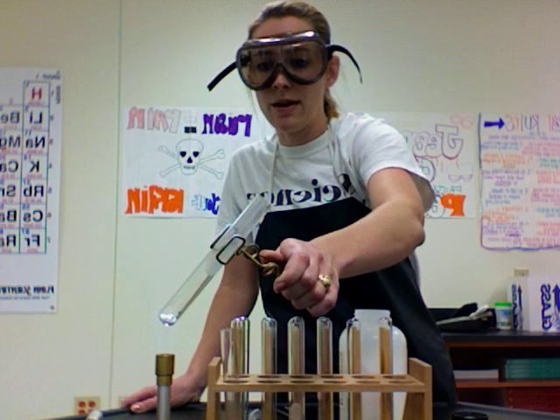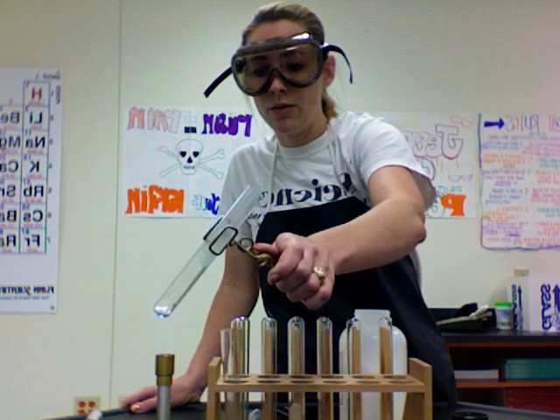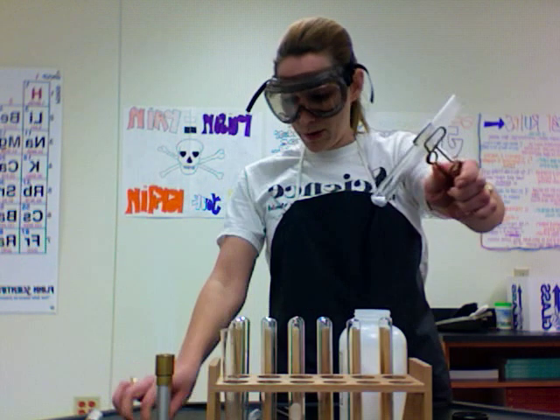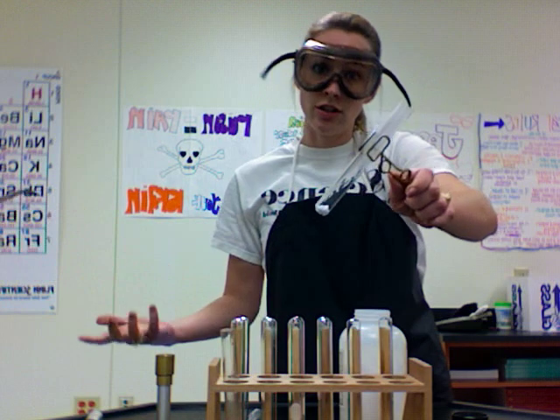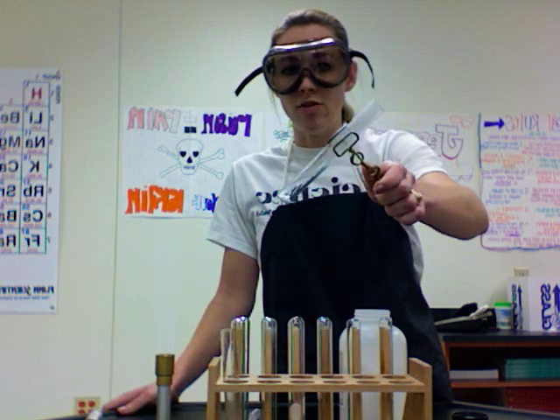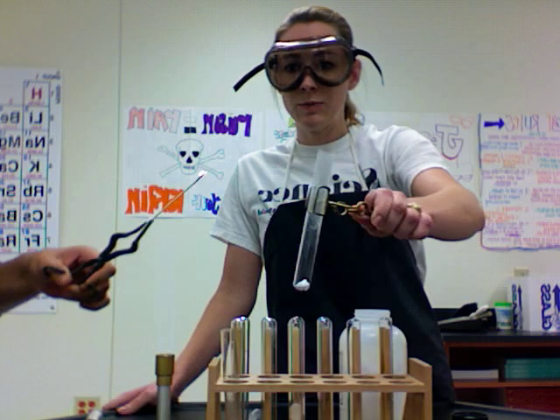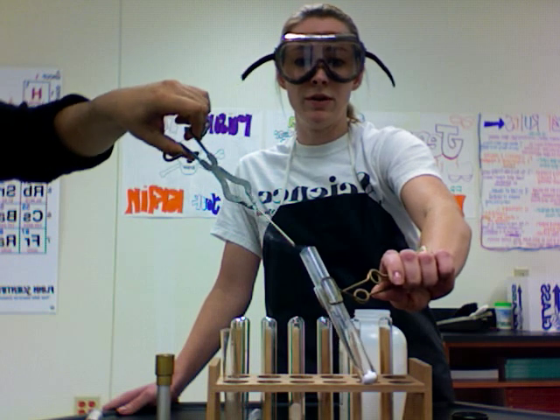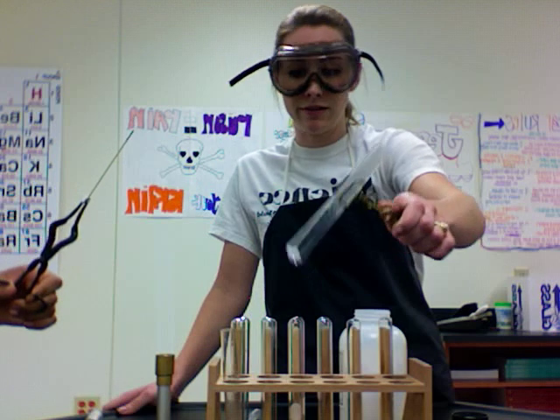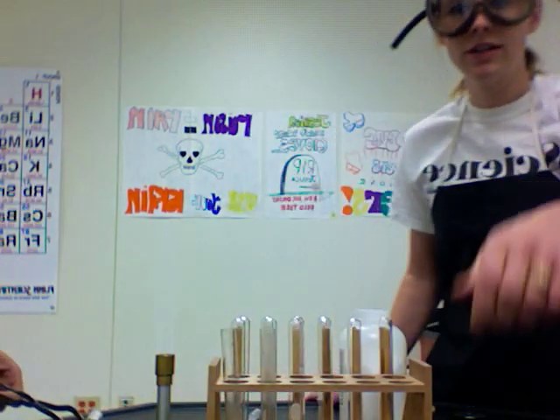I'm just going to let this heat for a little while and let it decompose, and then we will test for the presence of carbon dioxide. Carbon dioxide should make the fire go out, because that is what carbon dioxide does. Just get your splint and put it in there — and you can see, before we barely even get it in the test tube, it goes out. So we'll put it down here and move on to the next one.